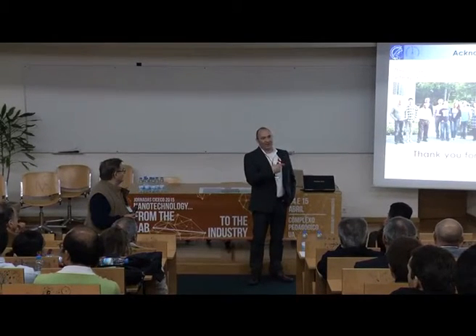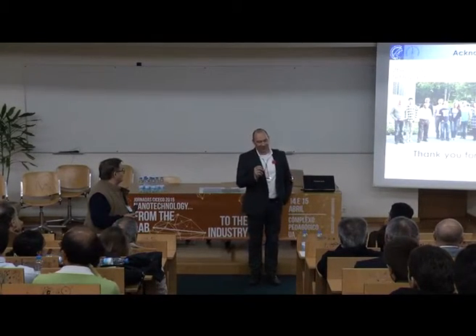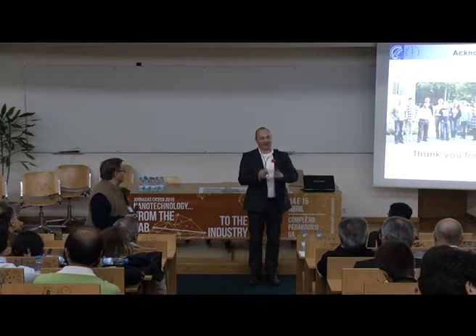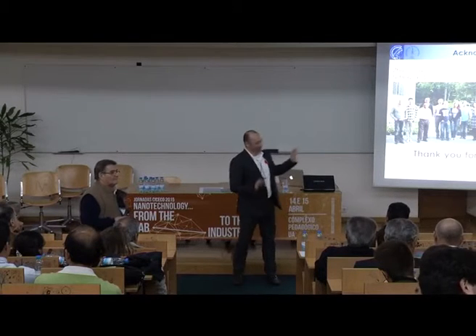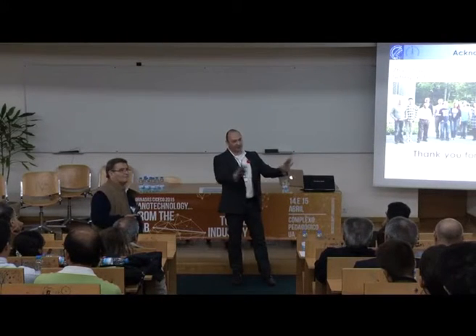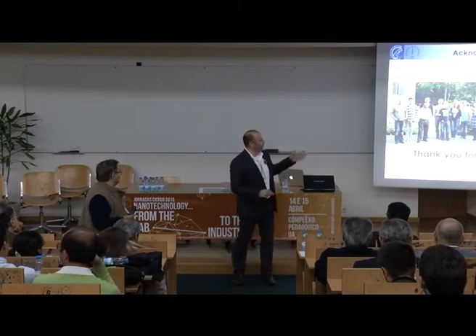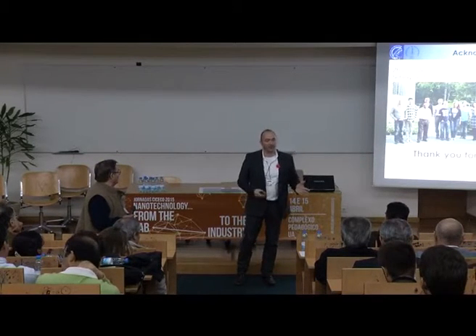But when you compare this with in-situ TEM, where you would wish to see the atoms, in in-situ TEM, as soon as things get a bit dynamic, you lose everything. And here, because we move further away, we see more statistical information of many, many atoms moving. And so we actually cover here a different time range and different speed of dynamics.